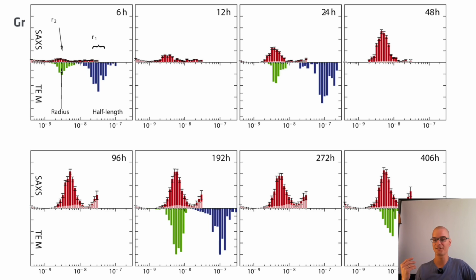Now, realize that for the small angle scattering measurements, we're averaging over billions of particles, whereas for the electron microscopy data, these were painstakingly measured, hand measured, artisanal, I would say, for about 500 precipitates for each sample. So it's a very tedious, painstaking work with electron microscopy.